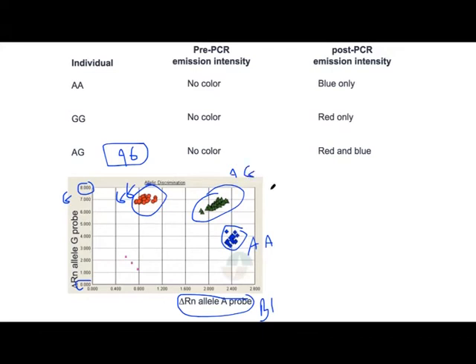Now, how do you use this? If you want to detect if the person has G6PD deficiency, or for example, if this person has sickle cell disease, if you want to diagnose a certain mutation, like the very common beta thalassemia, alpha thalassemia, there are some mutations which are common in Oman. You can design probes for those mutations, and you can get the answer very quickly in 40 minutes. All you need to do is prepare a master mix with the probes and the primers, put them in a 96-well plate, load each sample in each well and put it in the machine. Within 40 minutes to 1 hour, you're going to get the data of 96 individuals.